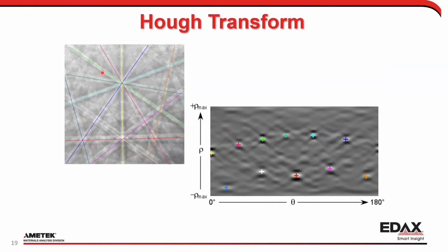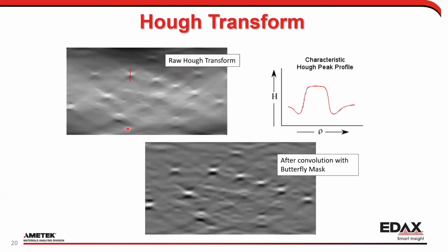How well the Hough is doing is something that, when you're understanding and troubleshooting something, you should be looking at. So here again, you can see the Hough. We want it to be in the middle. We want to make sure that these zone axes are well defined and nailing it here. And again, we're good. We're not cutting across the lines or anything like that. We're right in the middle, and all the intersections make sense. If you start getting a little bit higher or lower here on the Hough, these lines will move a little bit more to the edges, and that can affect the indexing itself.